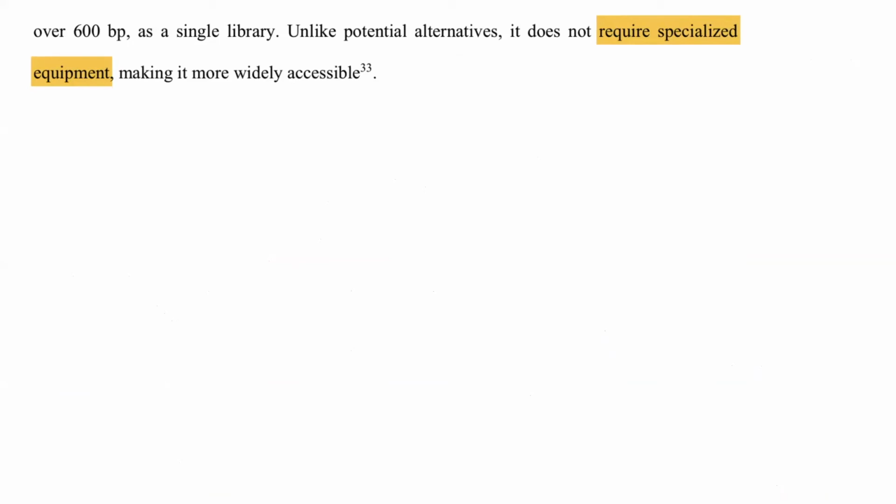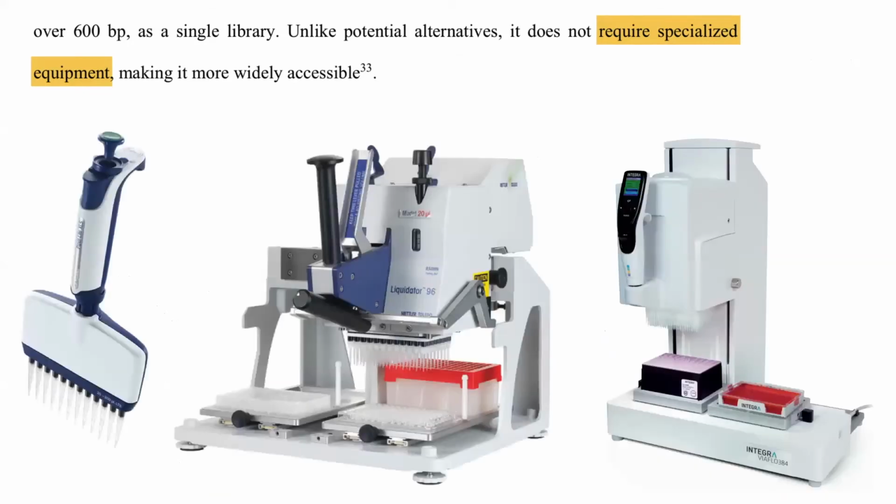And so we had this recent paper from authors at UW who mentioned that DropSynth required specialized equipment. This is true. Several years ago, when I first made the 384 bead pool, I actually did it manually using a multi-channel pipette. I would not recommend anybody ever try that. So see if you can find a local Rainin Liquidator or a ViaFlo for your bead preparation, which will really save you a lot of time, particularly in all the mixing and aliquoting and washing steps. And so with these, it becomes relatively simple to make both the 384 and 1536 pools.